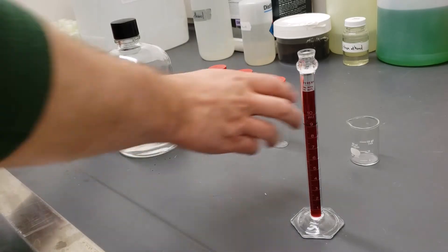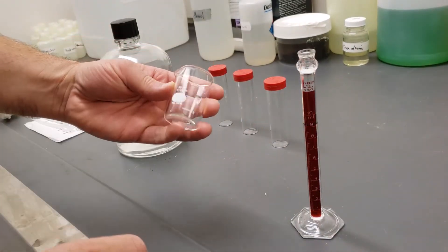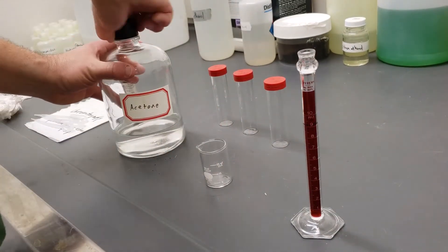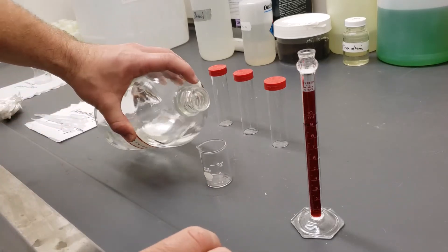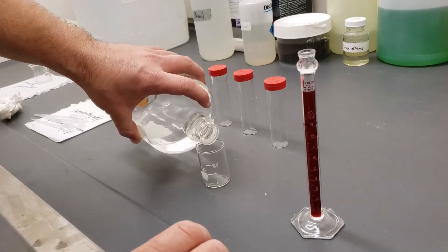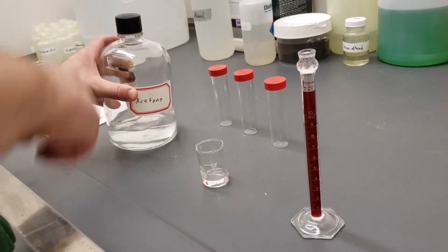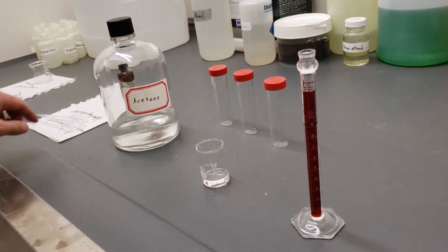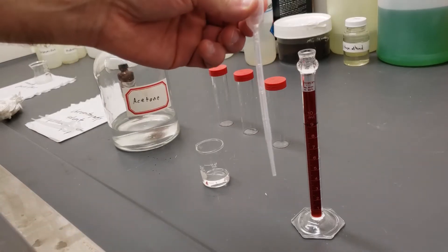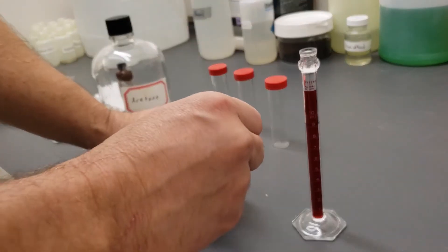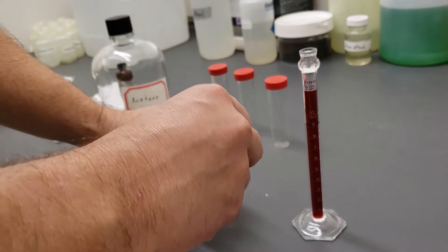I need to get some of this acetone out of here. I'm going to use this little beaker to transfer some acetone. Just need a little bit, one mil. I'm going to use my one mil pipette. Let's take out one mil here, approximately.